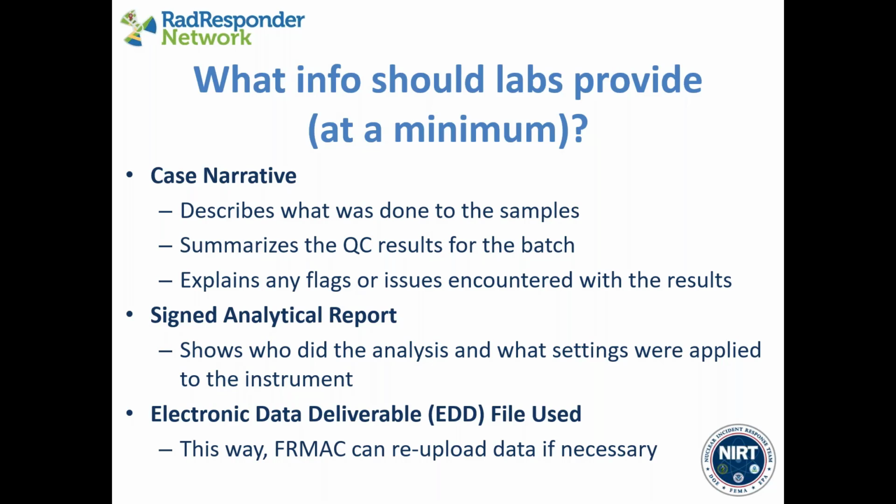All that's going to be signed by the analyst and possibly signed by a QA reviewer at the laboratory side. And that helps us compare the electronic results to what the lab report says to make sure there were no transcription errors or anything. And it also gives us a good idea of what was done with the samples and what assumptions were made, so that we can properly fill out our data verification form and flag our data in RadResponder, flag the quality of that data.